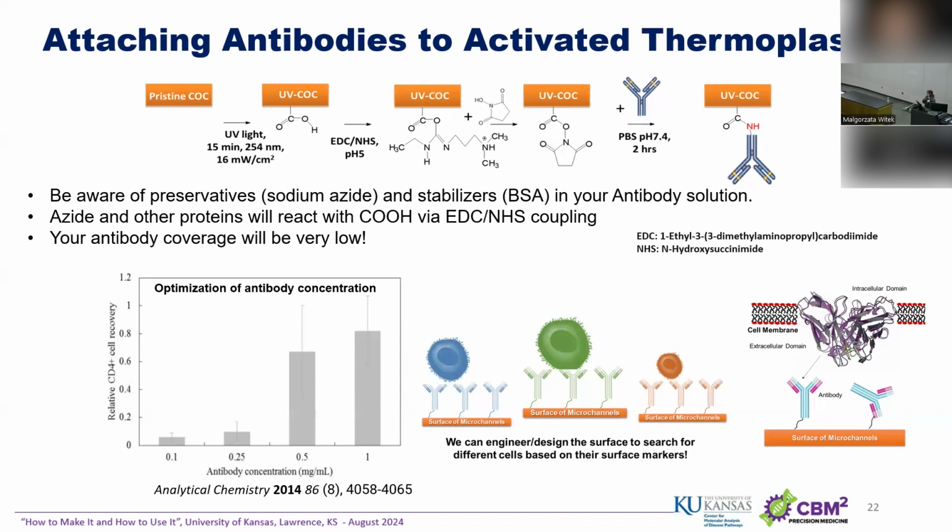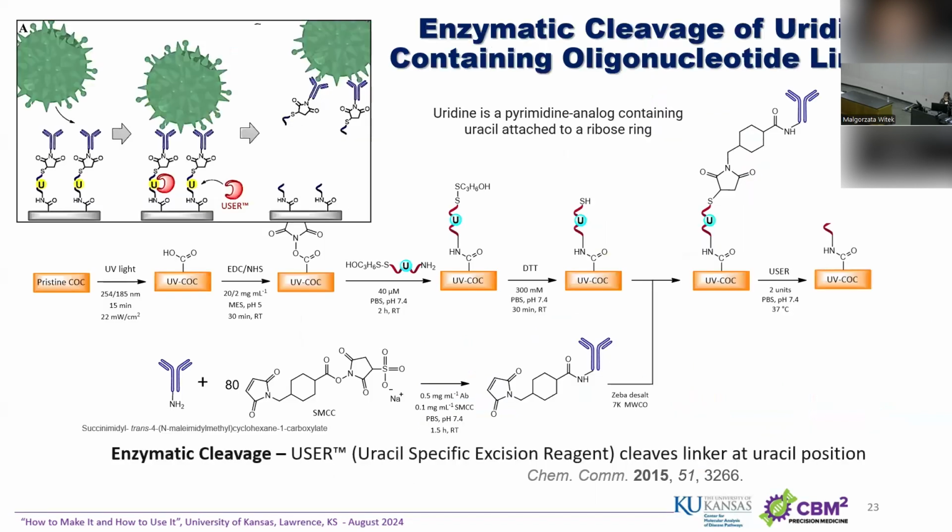Sodium azide will also react with your surface, and because it's a very small molecule, it will really decrease the coverage of your antibody on the surface by competing in this EDC NHS reaction. So always make sure that you remove either sodium azide or sometimes the protein, as antibodies are stabilized with bovine serum albumin, you have to find a way to remove it. And there are plenty of ways to do this, so this is not a big deal.